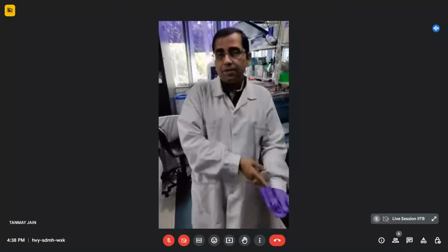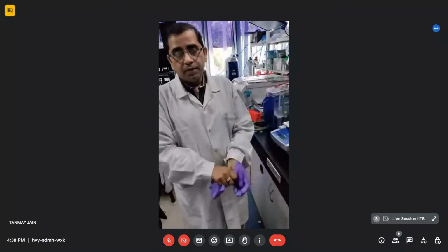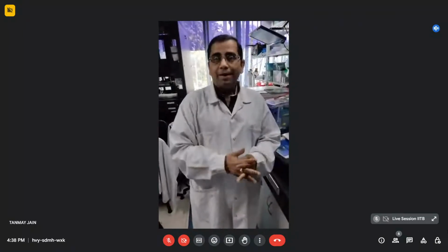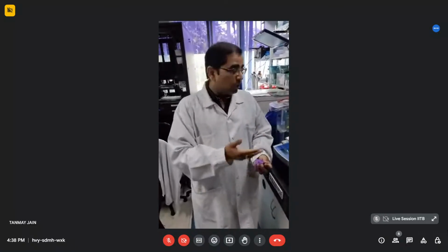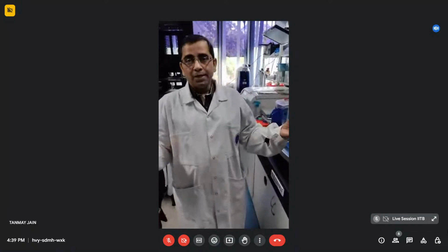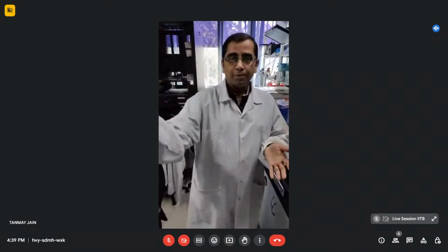standard, but at the same time has limitations in terms of the maximum coverage you can obtain from the proteome. If the sample is small, like a bacterial proteome you're looking at, this could still be a good place to go. If you're looking at a complex human sample or other kind of complex culture sample, then you might want to explore more of the direct mass spec based approaches. But again, as I was mentioning to you, it's good to be unbiased and utilize the best capabilities of different instrument platforms. So for instance, you can use IEF for the separation of the complex proteome, fractionate those and run them on the mass spec.